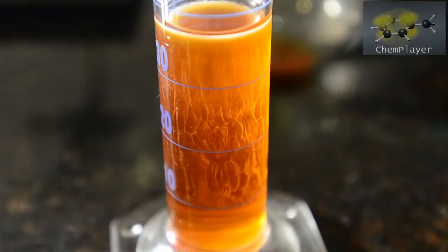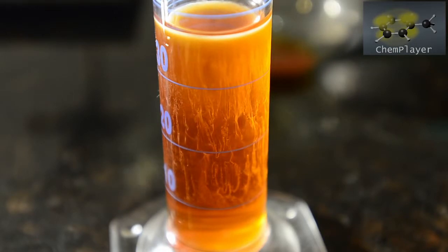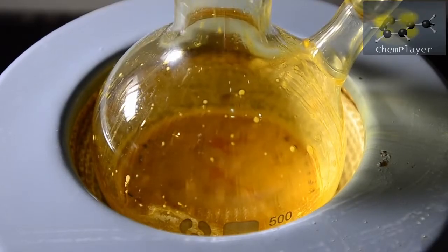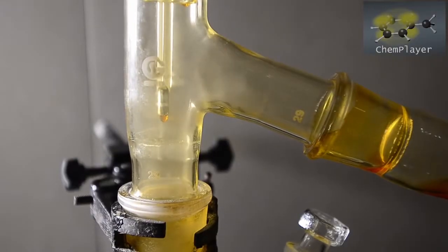Here's the first fraction of distillate collected. Obviously it contains some DCM, but it's exhibiting some very unusual behavior, as you can see here. It's water reactive and creates a milky precipitate in contact with it. The temperature then rose to 120 degrees C, and clouds of smoke began to appear in the apparatus.